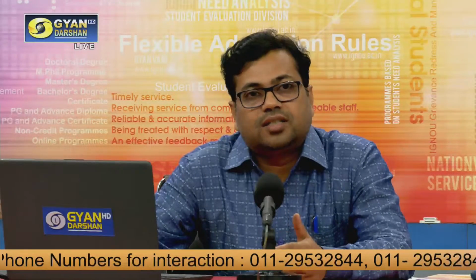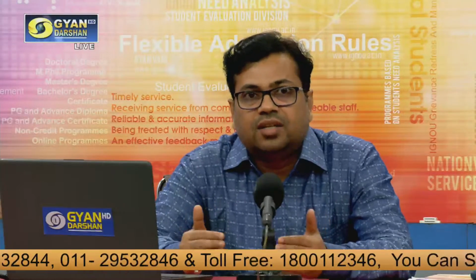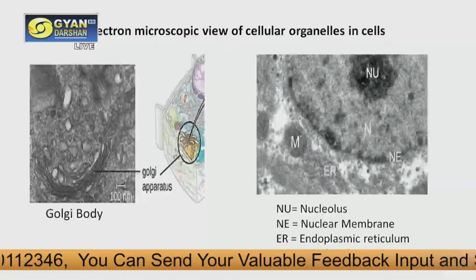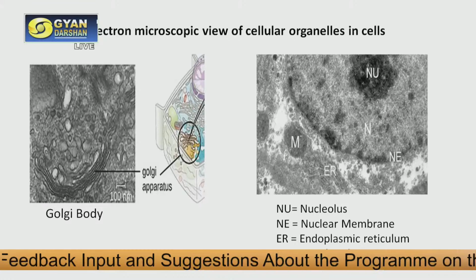If you are a researcher or a biochemist and you want to study the internal structure of cells, the internal structure of bacteria, or the internal or external structure of viruses, we use the electron microscope. Here you can see the electron microscopic view of cellular organelles and cells. These structures are captured by the electron microscope.